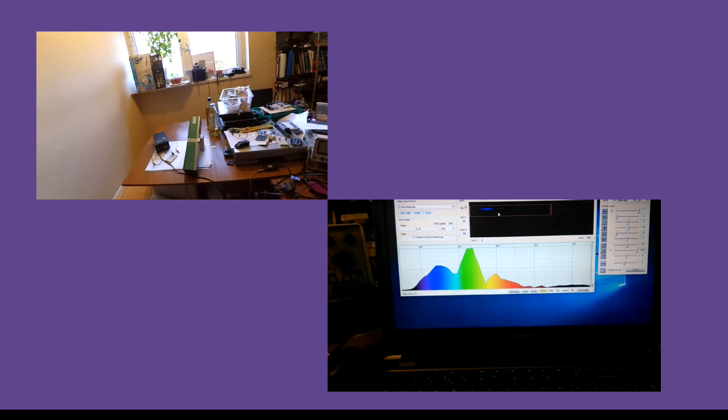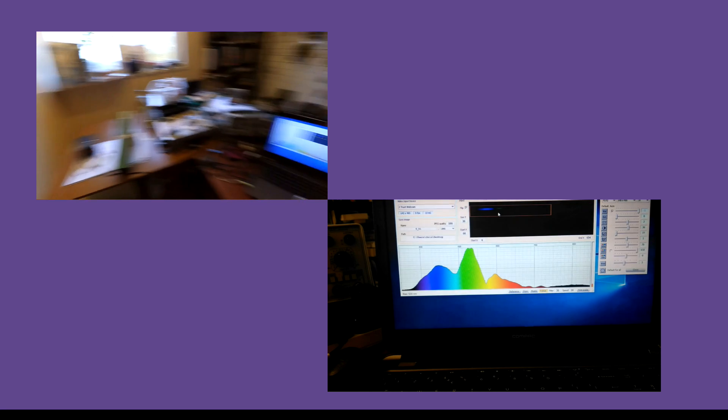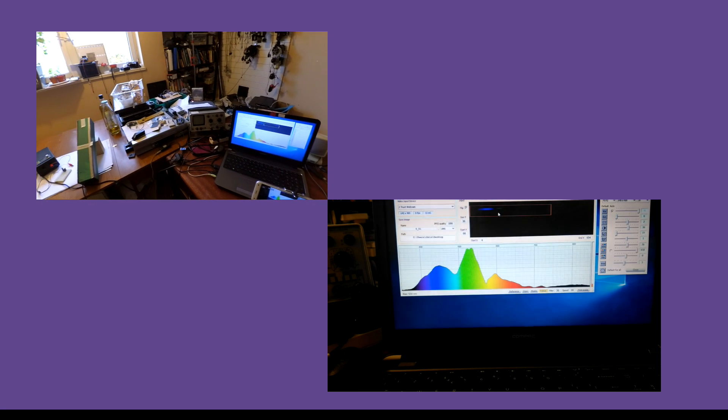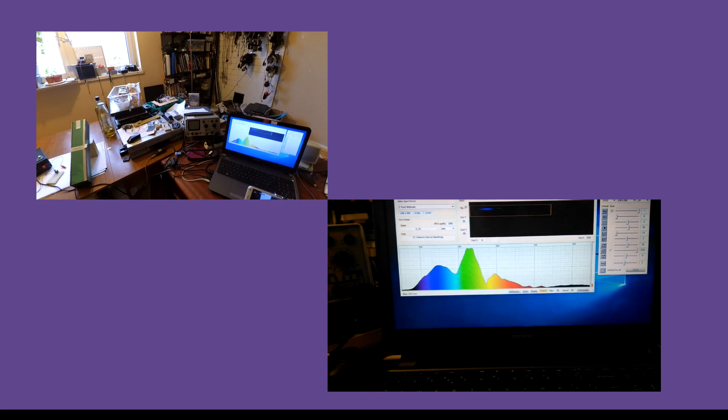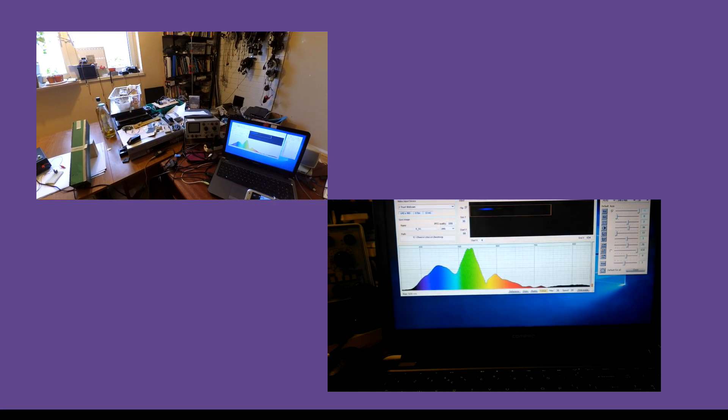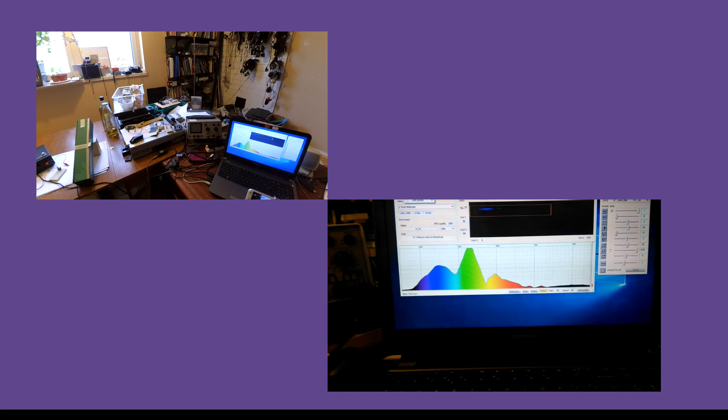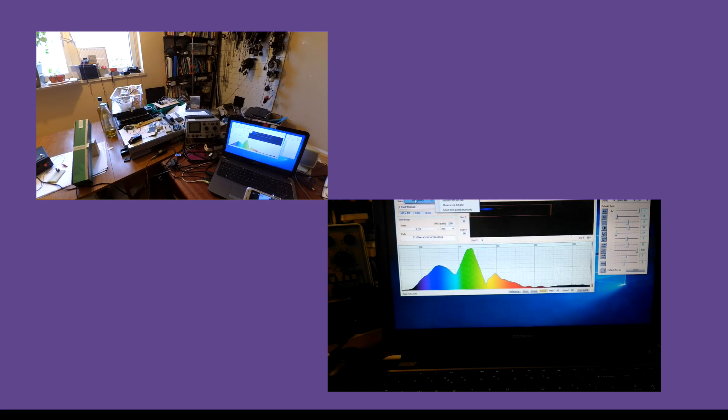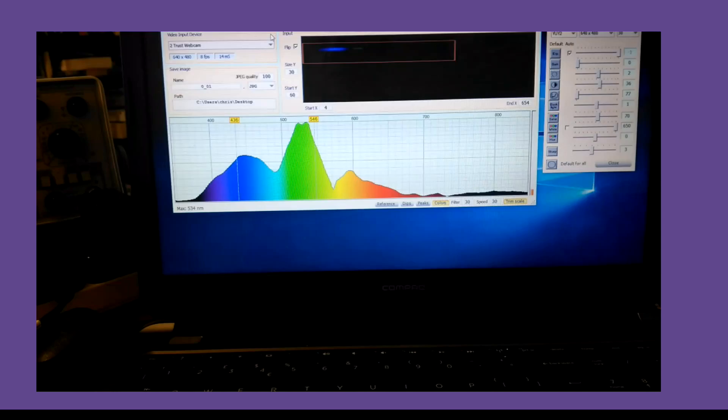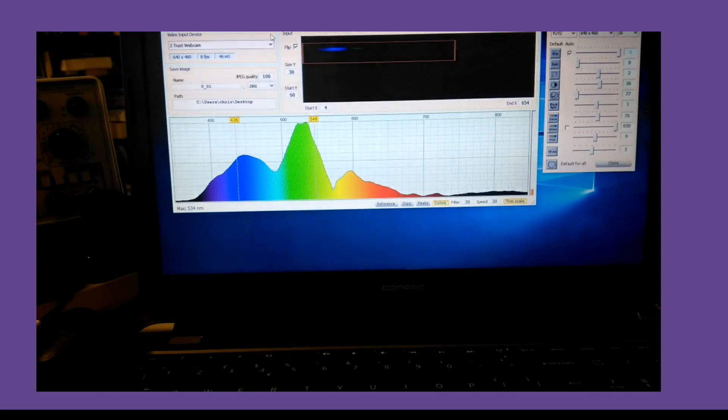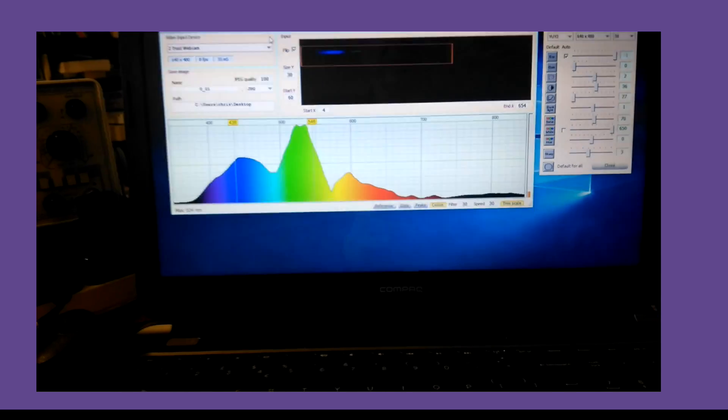The various physical aspects of the spectrometer. So we need to tell it about those things, and one way you can do that is you can look at some trim points. Let me show you on a web page how that works.